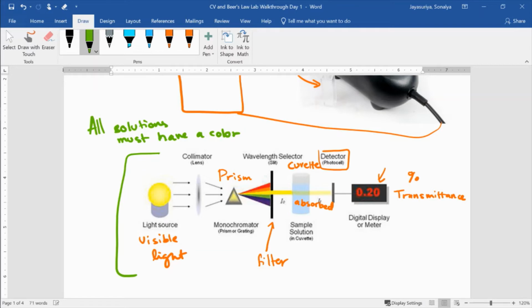It's actually a common question during AP exams to ask, oh, the student wanted to use Beer's law to measure concentration of sodium chloride. Why did it not work? Well, because sodium chloride has no color, it's a clear colorless solution, and therefore colorimetry or spectrophotometry cannot be used to measure concentration, okay? Now, that's not to say that those solutions do not absorb light. Those solutions do absorb light, except it's not maybe in the visible light spectrum, okay? It might be infrared light or UV light or microwaves that those solutions are absorbing, but it's not visible light.